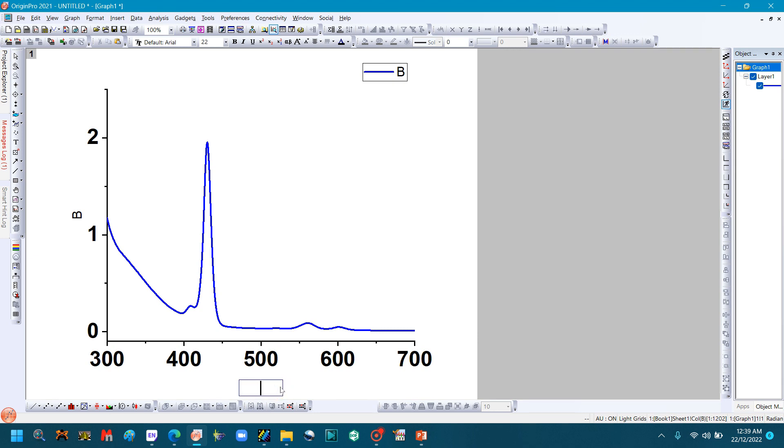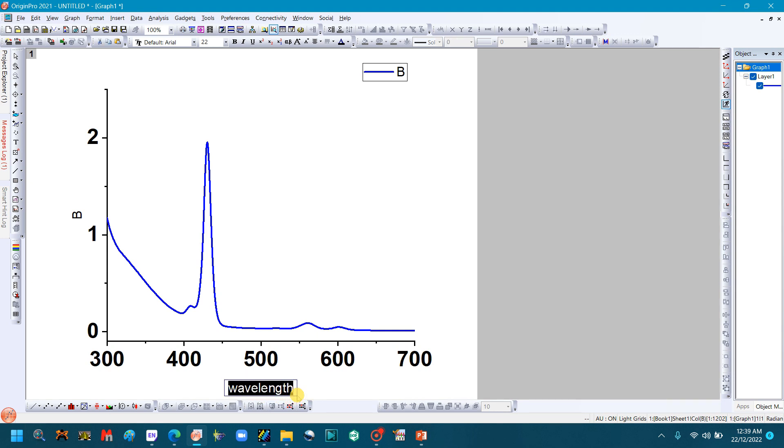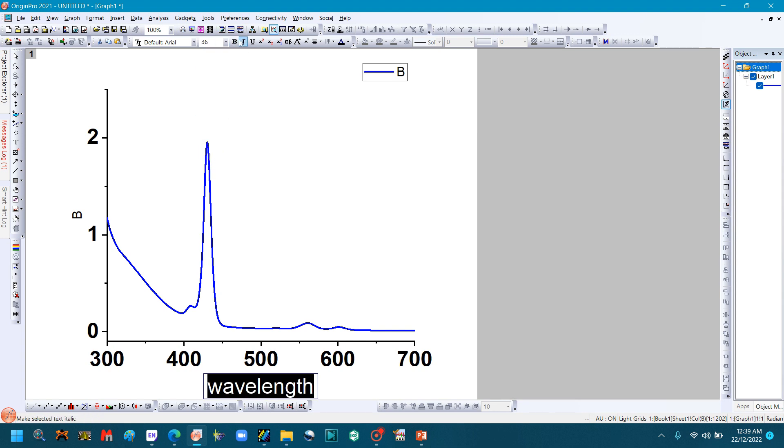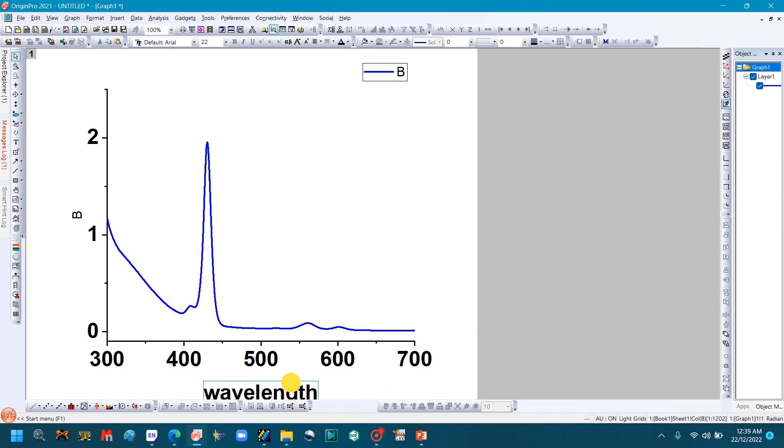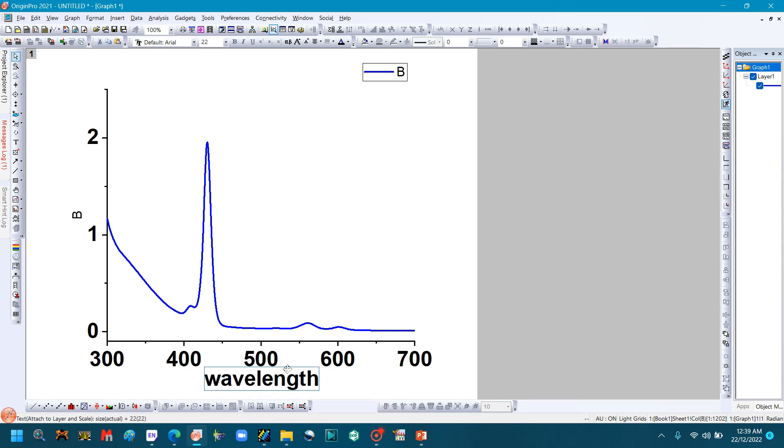You can also use the black y-axis and change the object. You can change the transparency policy to center if you want.